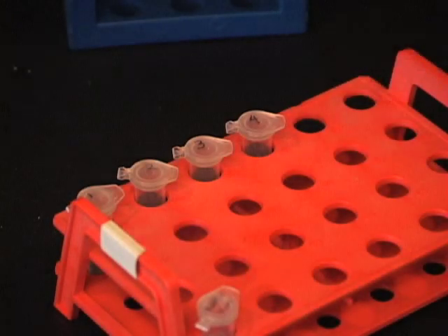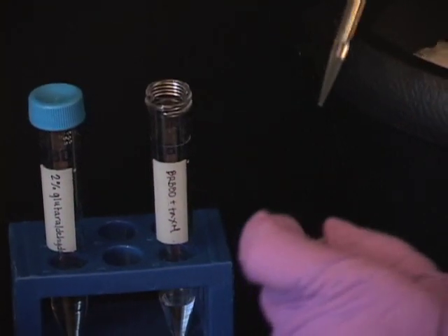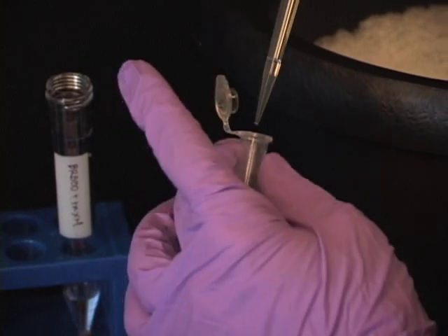As you add each of the following components, flick to mix or gently invert the tube. First, add BRB80 containing 10 µM taxol to each tube.